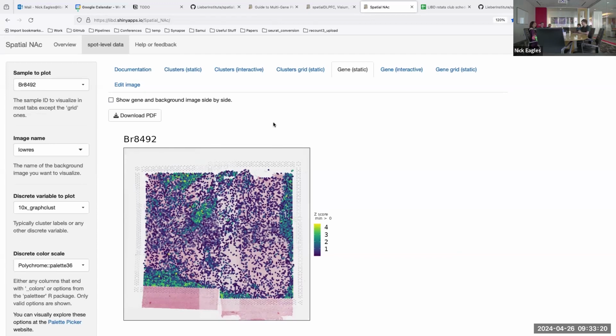Oh, it's okay, Nick. I know that I can plot, for example, the white matter, because I want to make a test to see if what I see in the image is white matter. I know that I can use any variable that has a continuous trend. It's good to combine, because each gene can be noisy by itself, and you can get a sort of consensus with this.